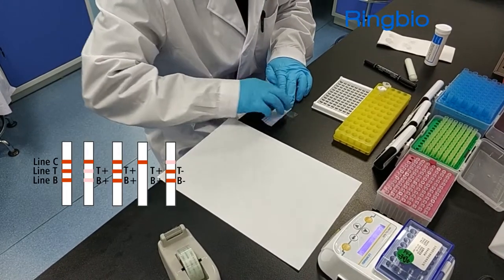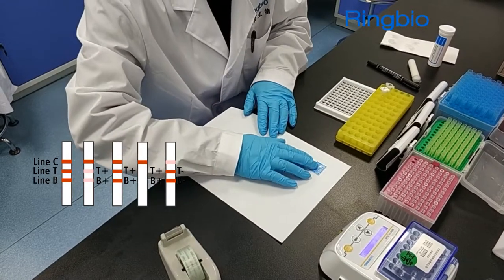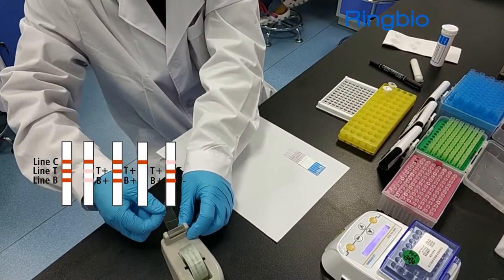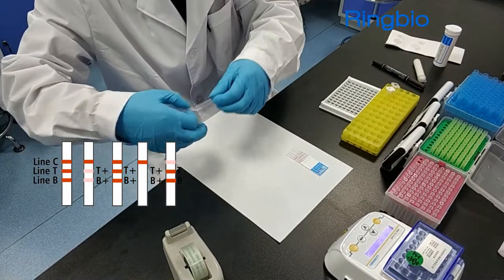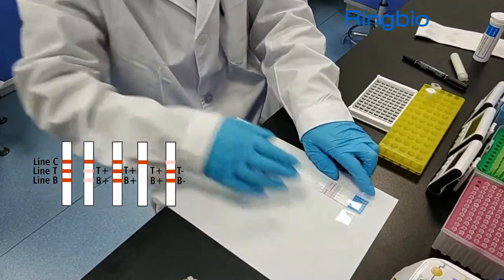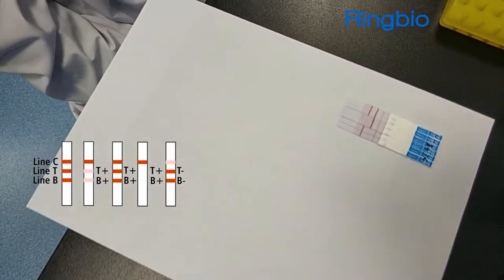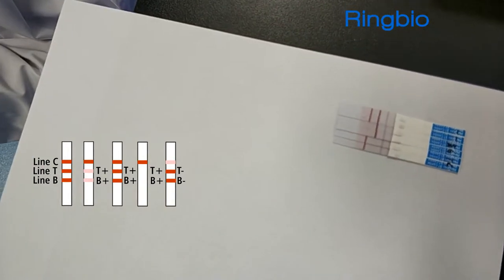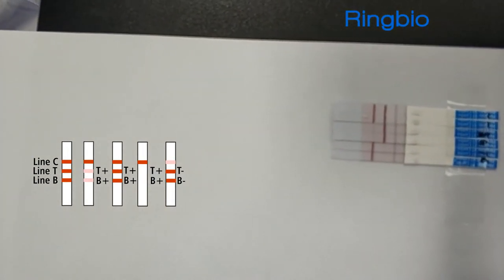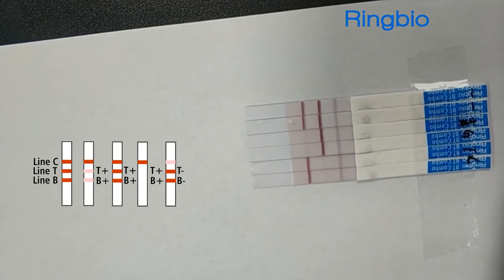There are three lines on the strip: control line, beta-lactam line and tetracycline line. Compare the colors of the line B, line T with line C. If colors of line B or line T is lighter or the same as line C, the result is positive. If line B or line T is darker than line C, the result is negative. No line B or no line T also means positive. In any cases, line C is always visible as a quality indicator of the test.